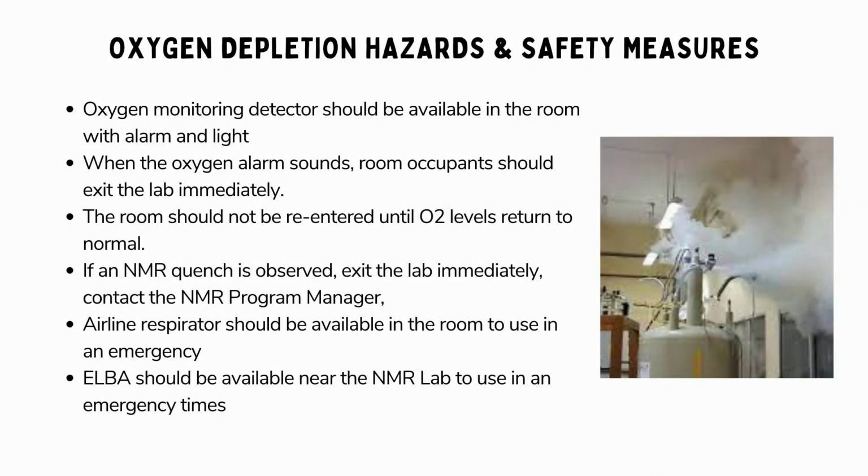Oxygen depletion hazards and safety measures. An oxygen monitoring detector equipped with an alarm and light should be installed in the room. Occupants must immediately exit the lab when the oxygen alarm sounds. Re-entry into the room is prohibited until oxygen levels are confirmed to be normal.